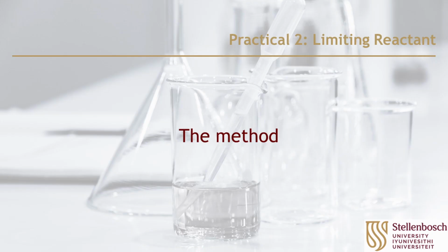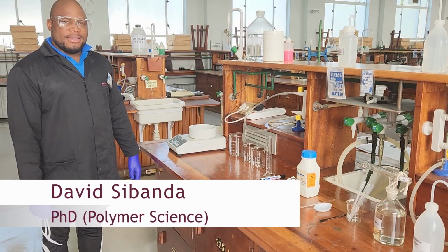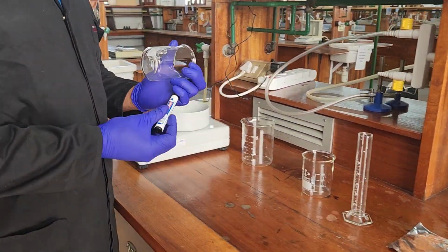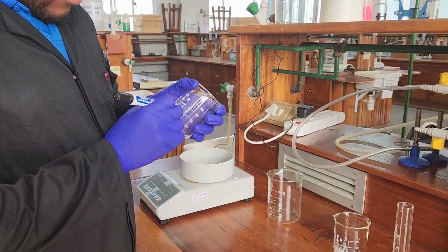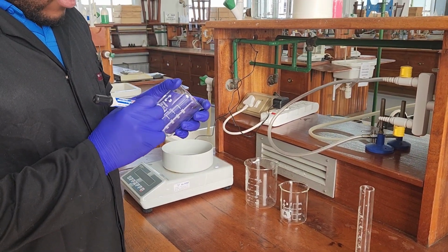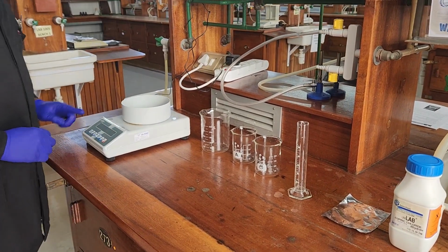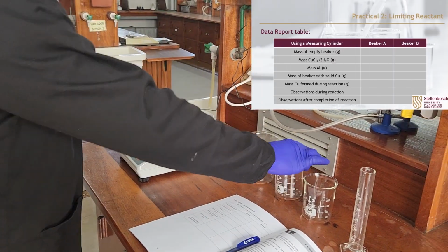The method is as follows. Label one 250 cubic centimeter glass beaker as A and the other beaker as B. Weigh these beakers and record their masses in the data report table, which is found in your prac manual.